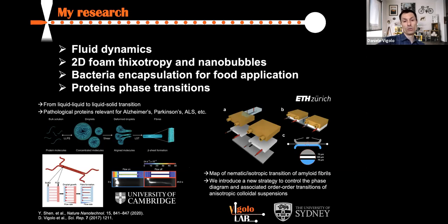And again, you can use a concentration gradient, in this case in a microfluidic channel, and really study the transition as it goes from a lower concentration to a higher concentration into a nematic phase. And again, this is another good example of a multidisciplinary approach, in my opinion.